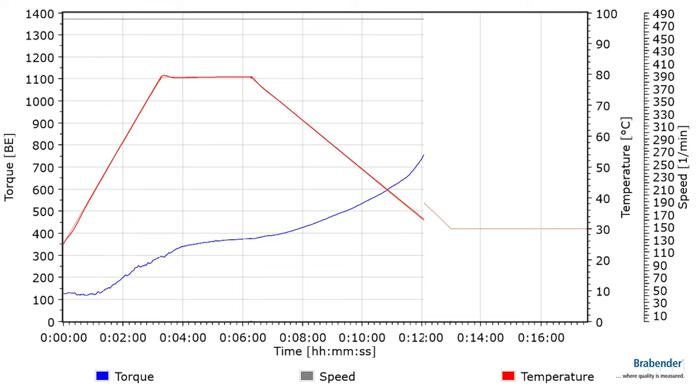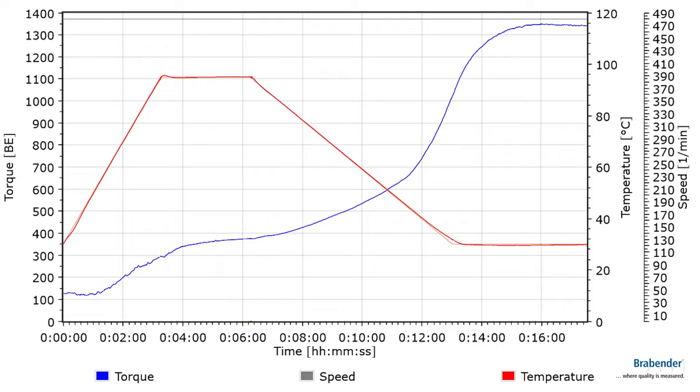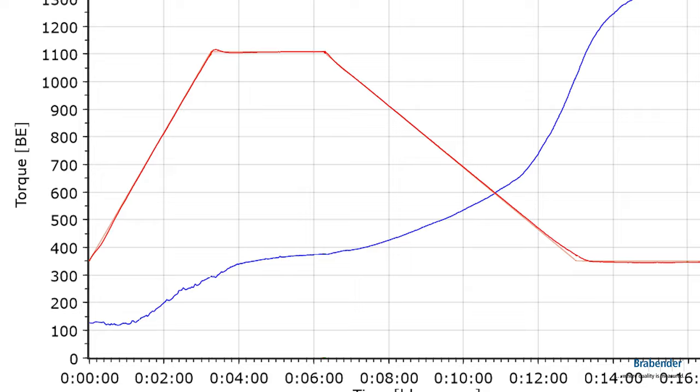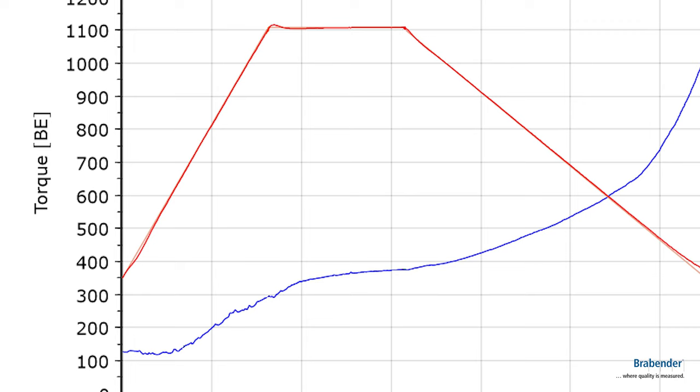The benefit of the ViscoQIC for characterization of seaweed is its high heating and cooling ability. We can heat with 20 Kelvin per minute, which allows us to reduce the measurement time extremely compared to other devices.